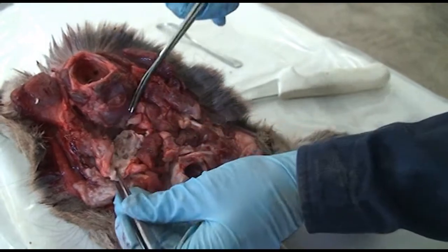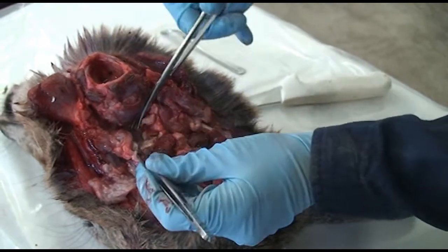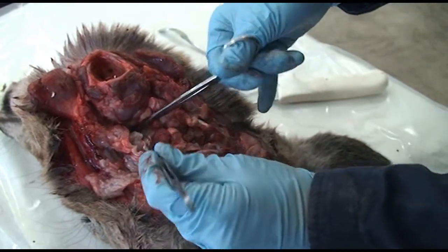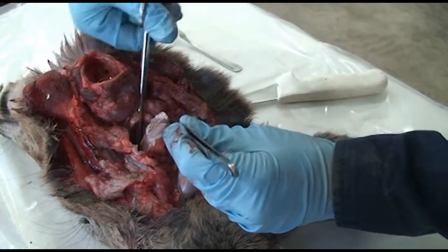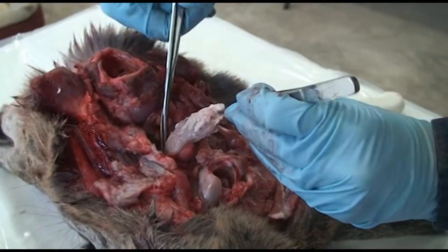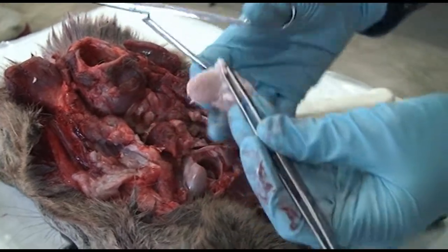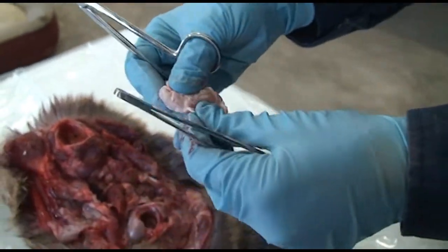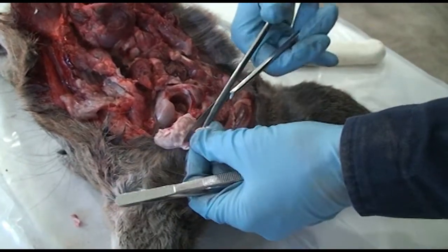And as you hold on to it, you can peel it out. You can grab it a little harder, especially with the connective tissue around it, than you can the brain tissue. It is a tougher tissue. And so you can hang on to it and work it, and it peels out of there. We'll take a look at it here once we get this one out. Now if you get a lot of extra connective tissue stuck to the lymph node, you can trim that off before you put it in the formalin jar.